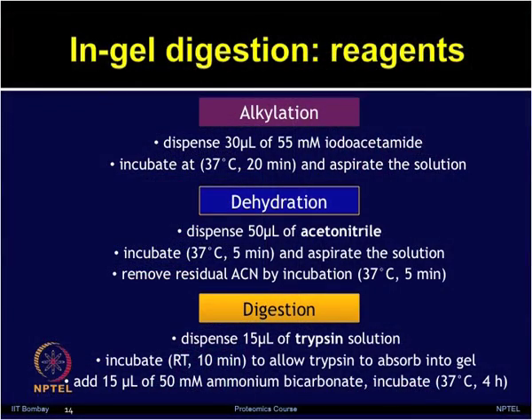Once digestion is done, which is usually the overnight step, one needs to do the peptide extraction of the digested proteins. Peptides generated through proteolytic cleavage can be extracted by using a recipe including formic acid or trifluoroacetic acid (TFA) in a 50% acetonitrile solution.